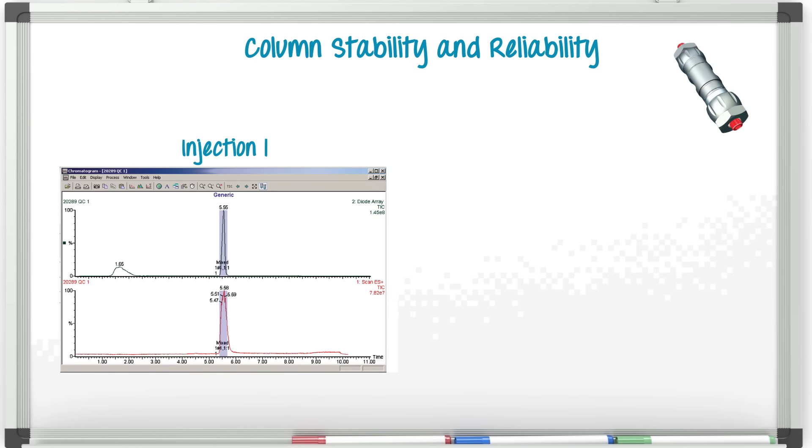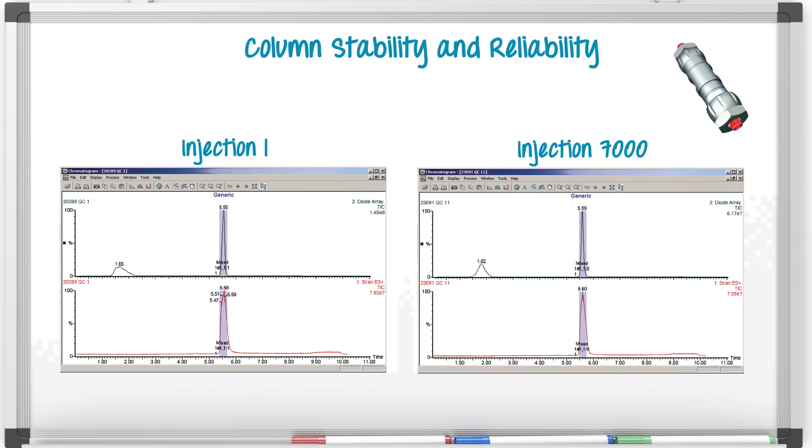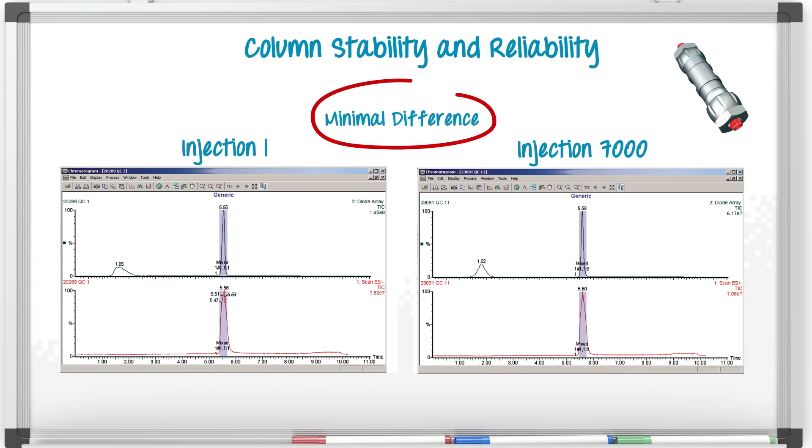Here is a first injection of an OBD column. And here is what it looks like after 7,000 injections. Not much difference. Very impressive, Steve. How come other columns don't do that as well?